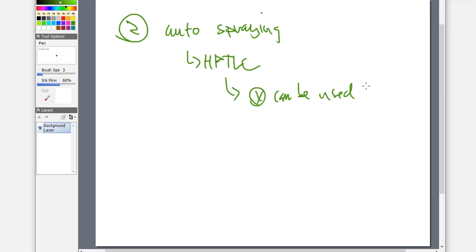But if I'm putting something into a solvent and that solvent's a little viscous, maybe more viscous than simply water, what's going to happen is that the auto sprayer is going to clog. And when it clogs, that means I can't spray. It's potentially ruined my plate. I'm going to have to take the sprayer nozzle off. I'm going to have to clean it. I'm going to have to reattempt to spray again, but that also means I'm going to have to reattempt my plate development again.